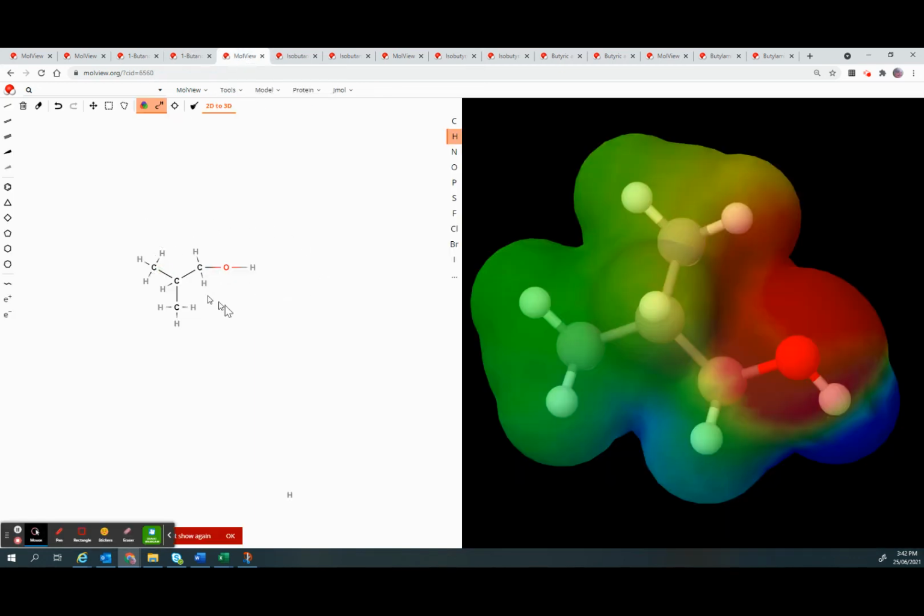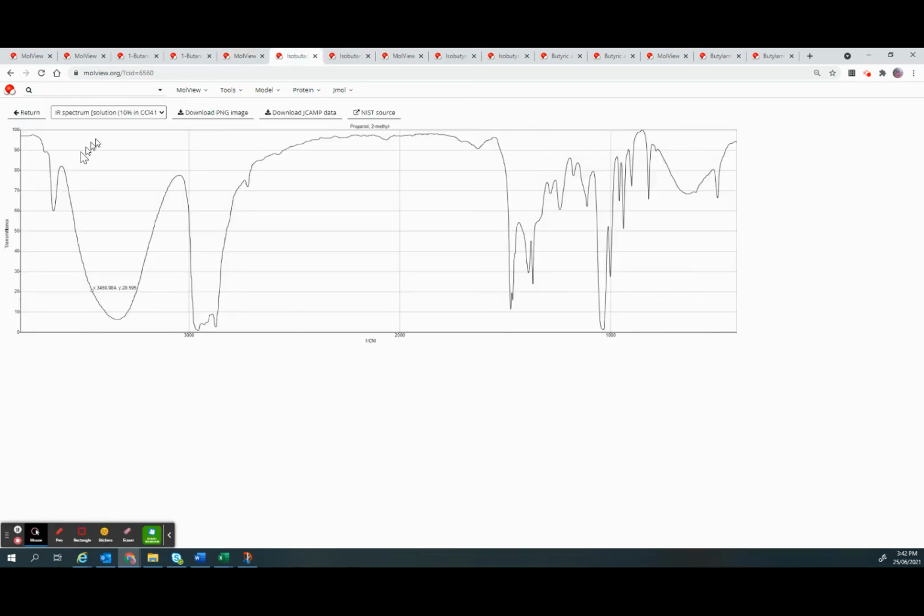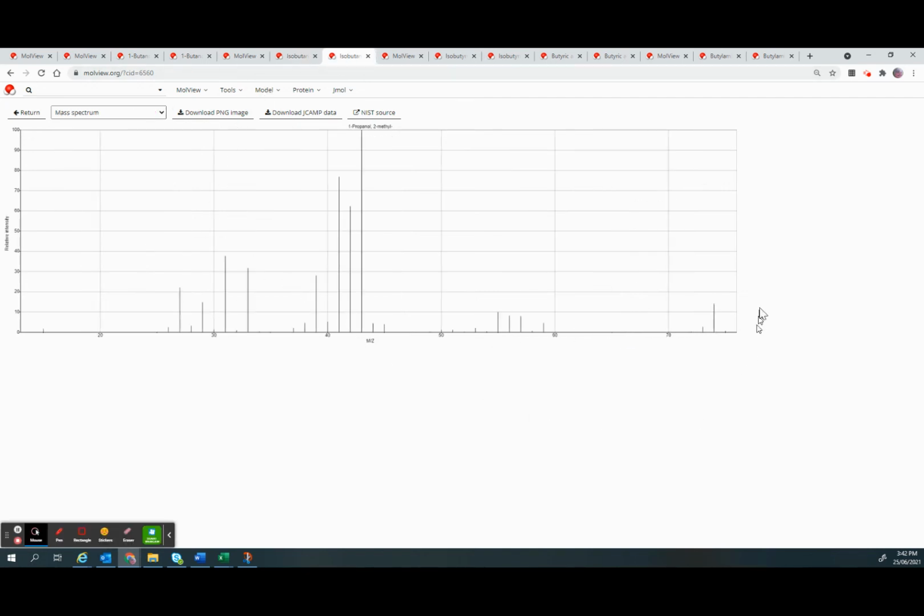So here's an example of an isomer of the one we had, where these two are now in the same environment. And if I look now, we have that same parabolic peak. Don't worry about that. But otherwise, here's that CO peak very clearly. Otherwise, those are the CH stretches. And here's the mass. And now you see the M plus peak is quite strong. That's the M plus minus 1. And that tiny little peak there is that isotopic peak.